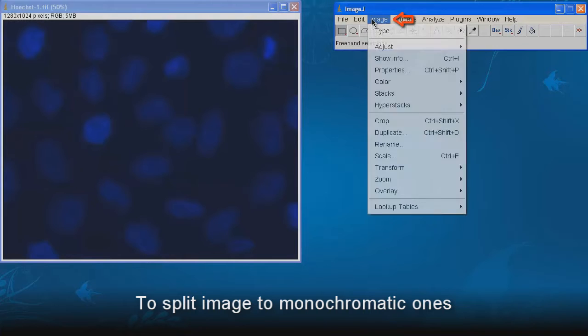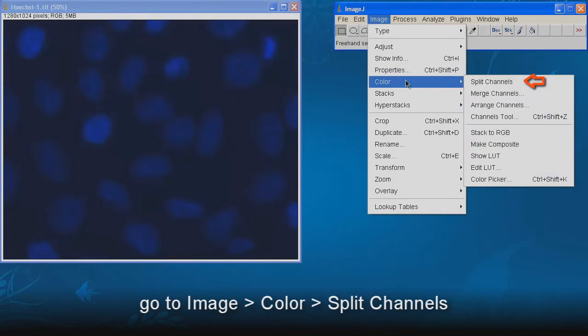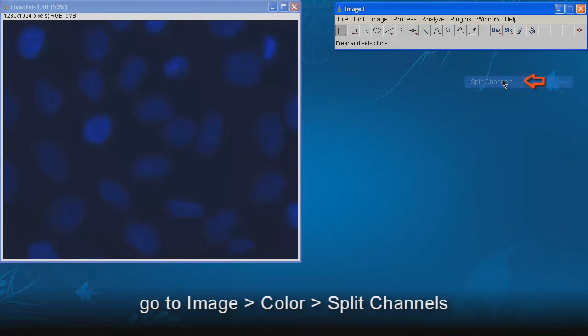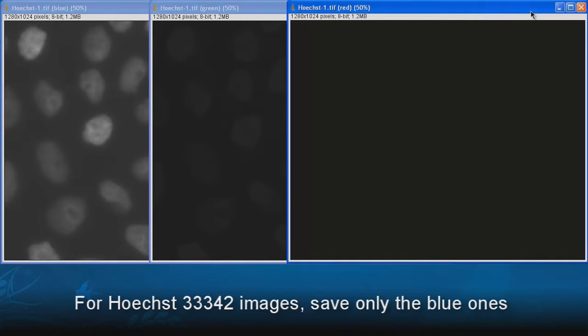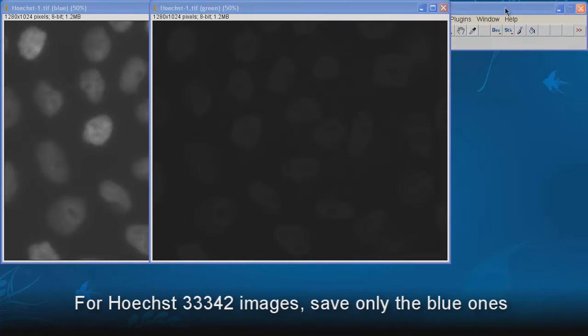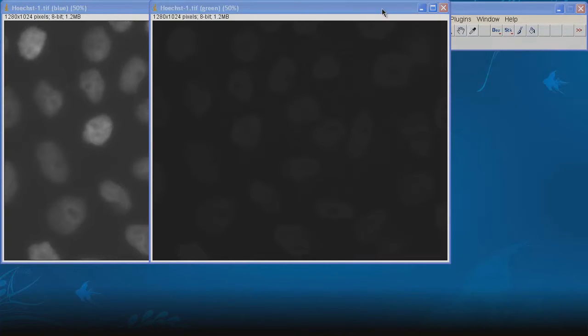To split image to monochromatic ones, go to Image, Color, Split Channels. Three images are resulted: red, green and blue. For Hoechst dye images, save only the blue ones.